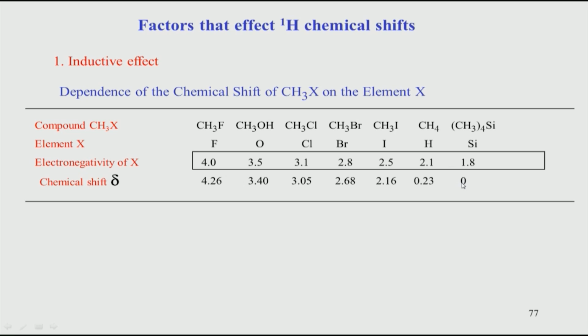You can choose any other molecule as 0, but there are different reasons why we choose this particular compound as a reference. We will see that again in later classes. One reason is that this is a very inert compound. It will not interact with the compound in your sample. Secondly, it is independent of many conditions such as temperature and pH. There is of course slight variation, but those variations are very minor compared to what happens in your molecule.